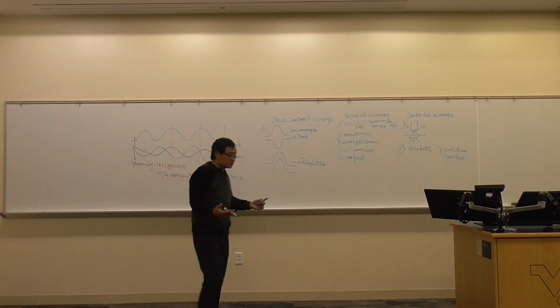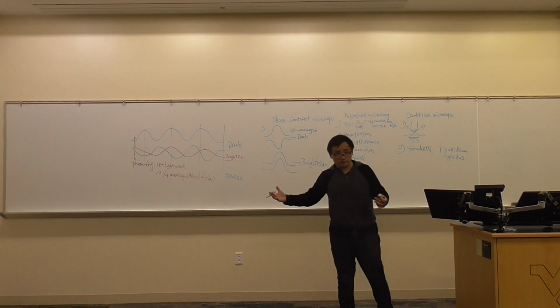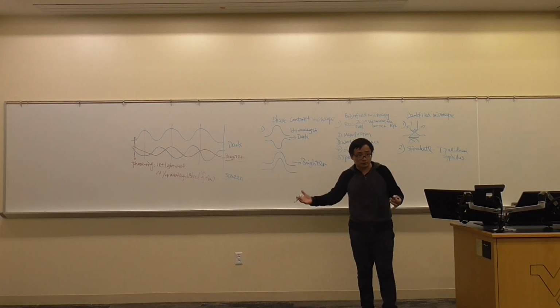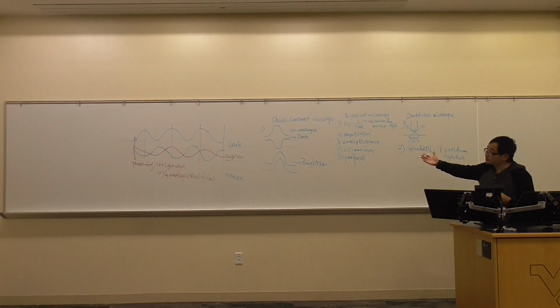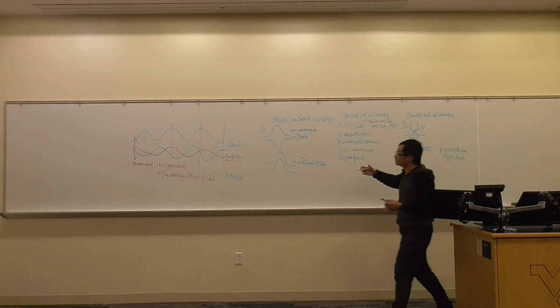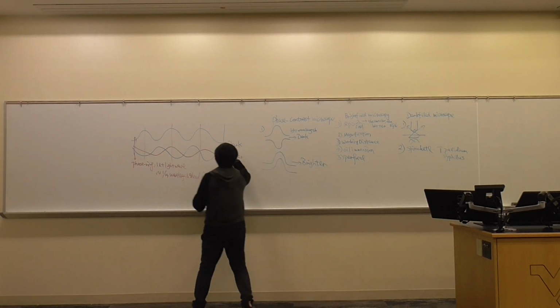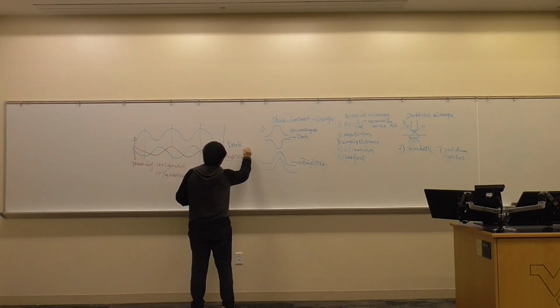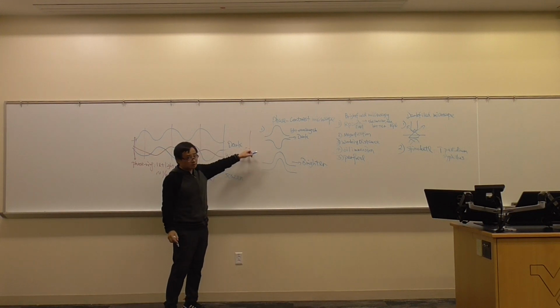Originally, if I didn't put a phase ring, it's going to be dark. So I put a phase ring, let the wavelengths be 1/4 wavelength ahead or back, and the light shows that. And if you think about the screen, it's finally going to come here. So this will be more focused and you're going to see the image. That's the function of the phase contrast microscope.